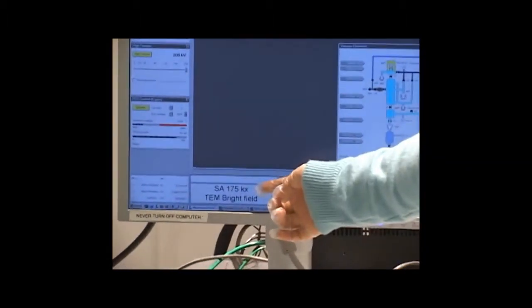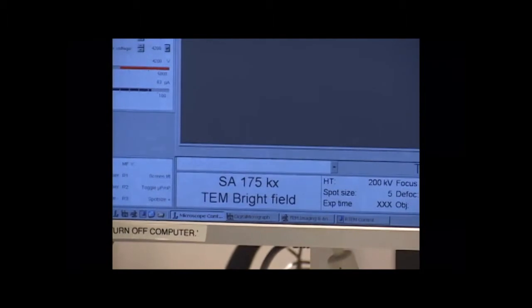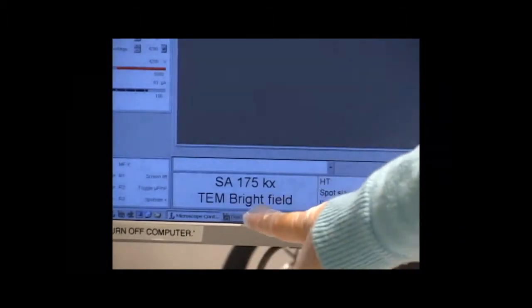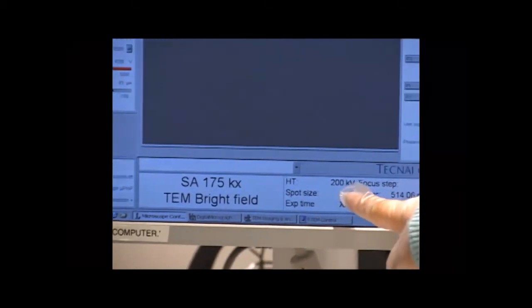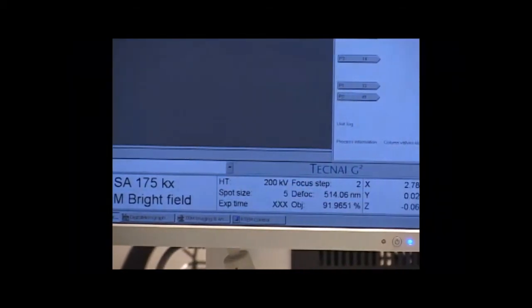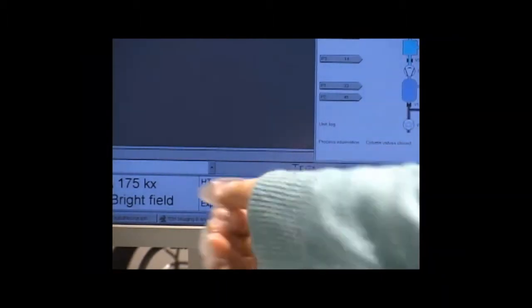In the User Interface software, the box on the lower left tells the magnification and the microscope mode. Currently, TEM bright field and 175,000 magnification. To the right, the beam energy and spot size are shown. While setting up, the spot size will be 5, and during operation, it will be 3. The exposure time tells you the brightness and illumination of the beam.